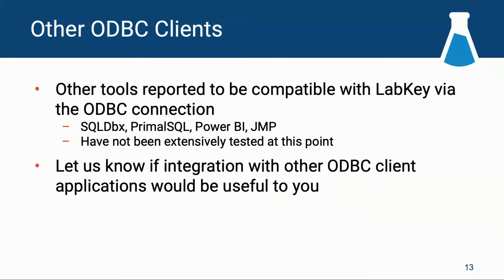They have not been extensively tested, but some of our clients told us that they tried it out and it worked for them. We are also always looking to expand your ability to visualize LabKey data using an ODBC connection, so let us know if integration with another ODBC client would be useful to your organization.